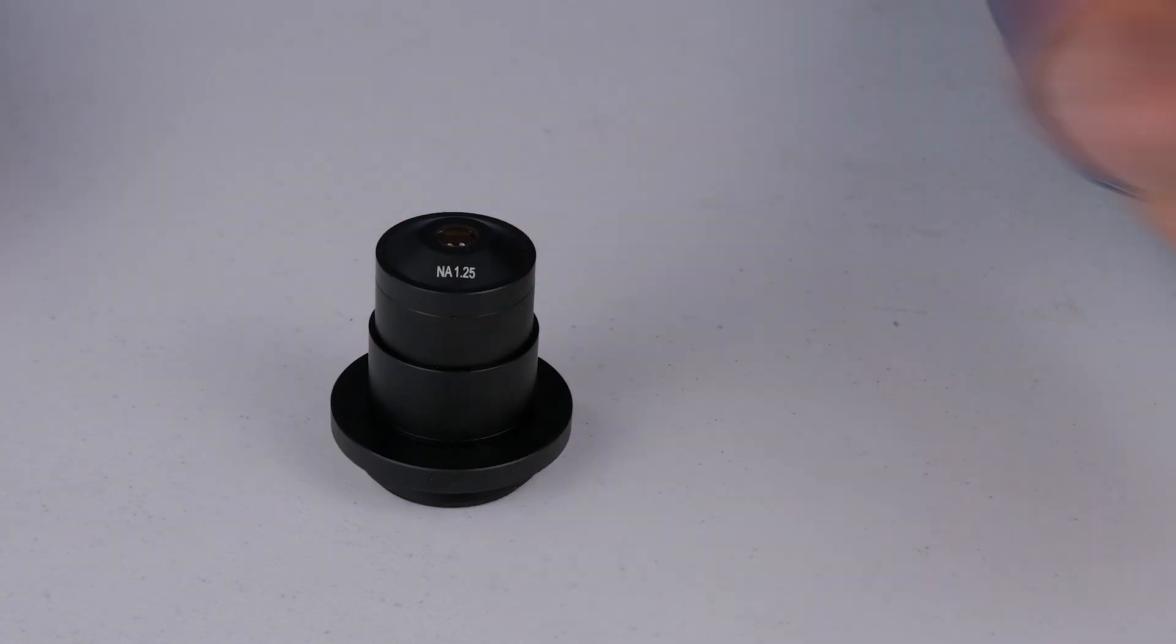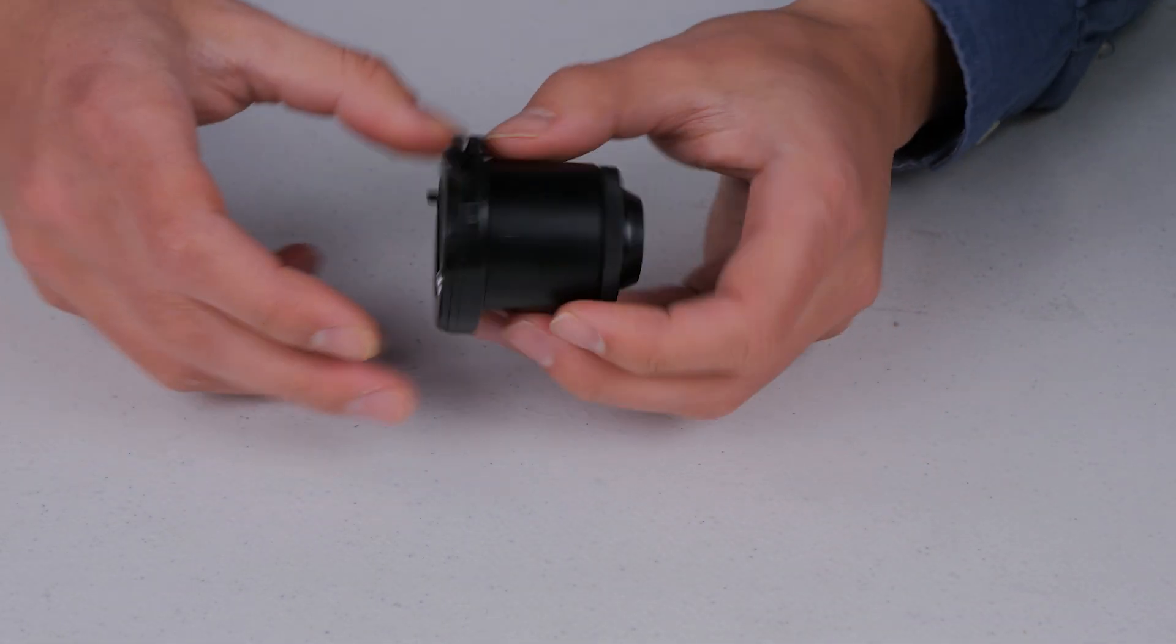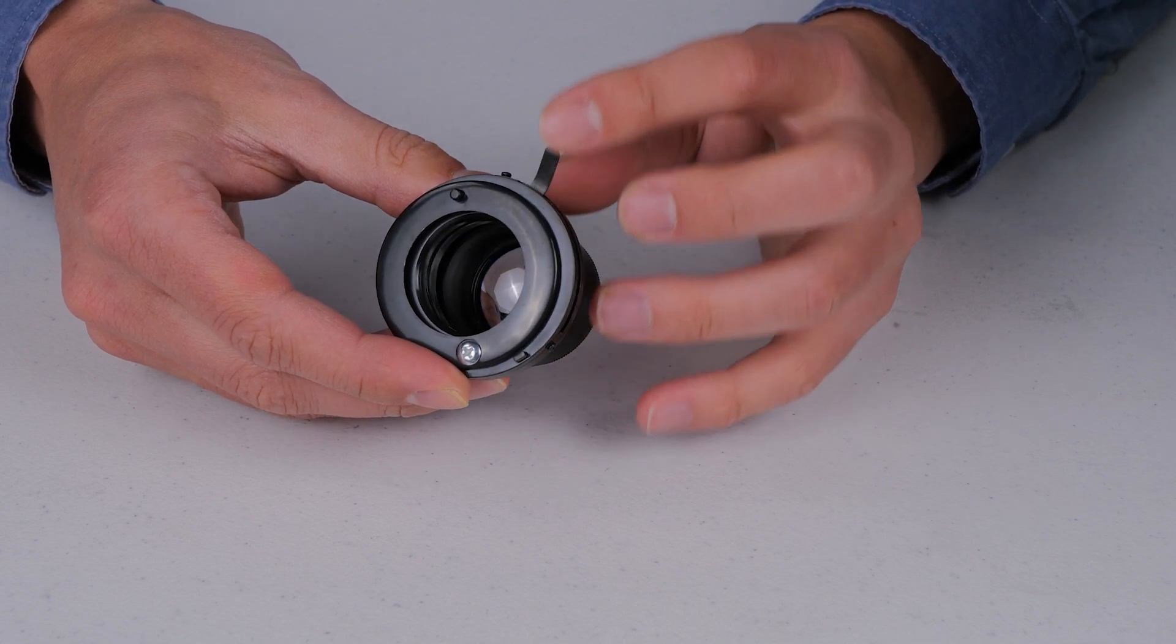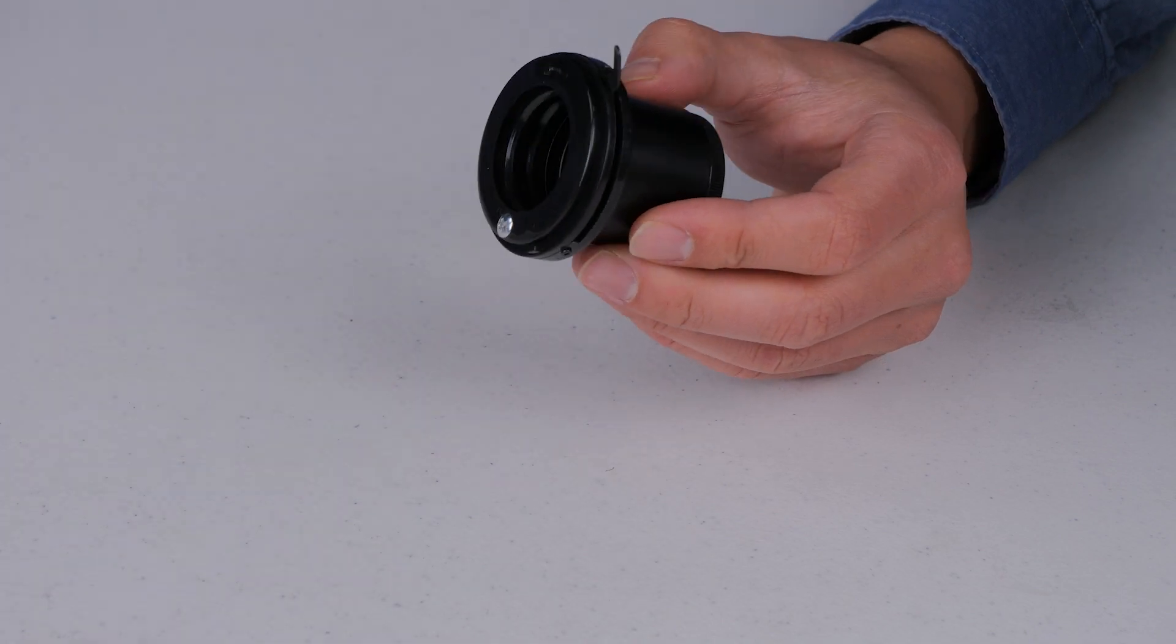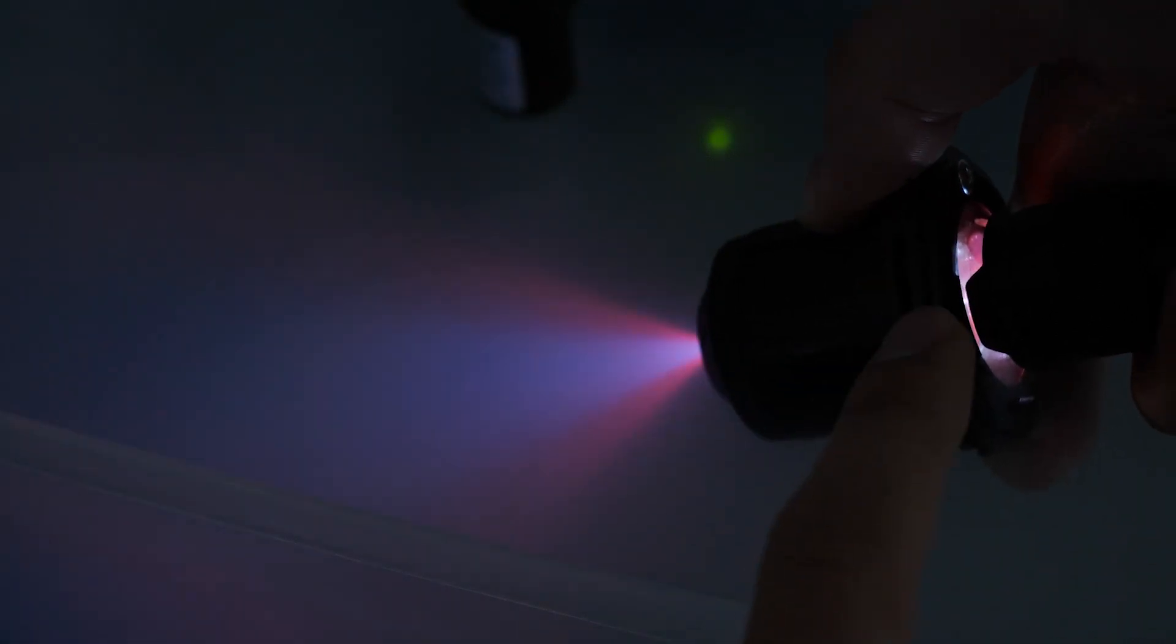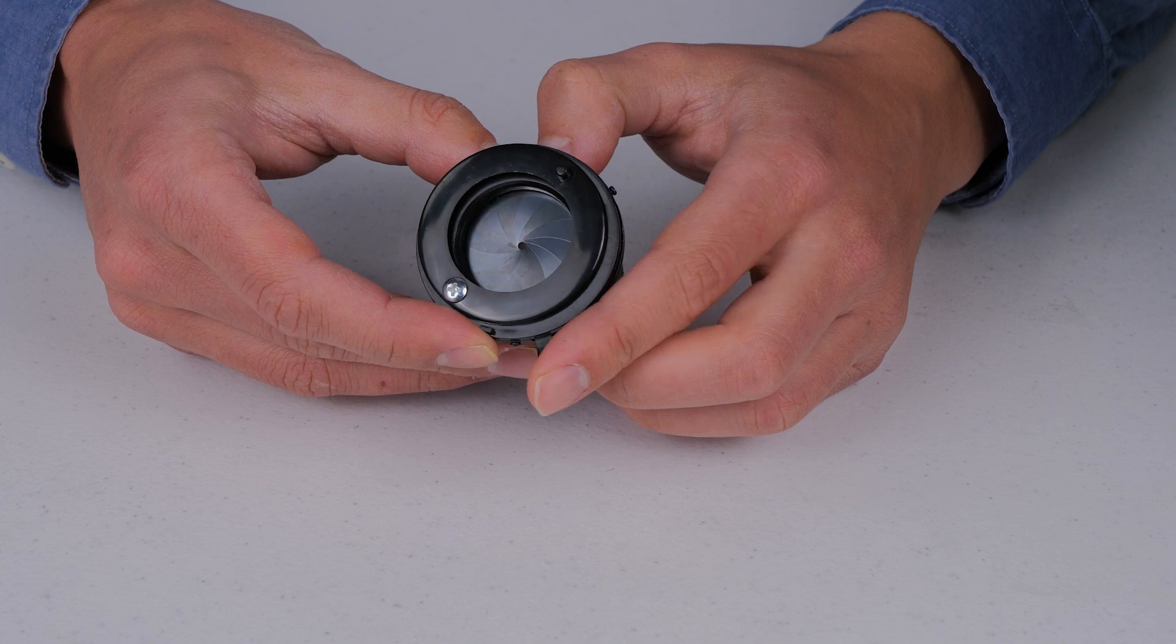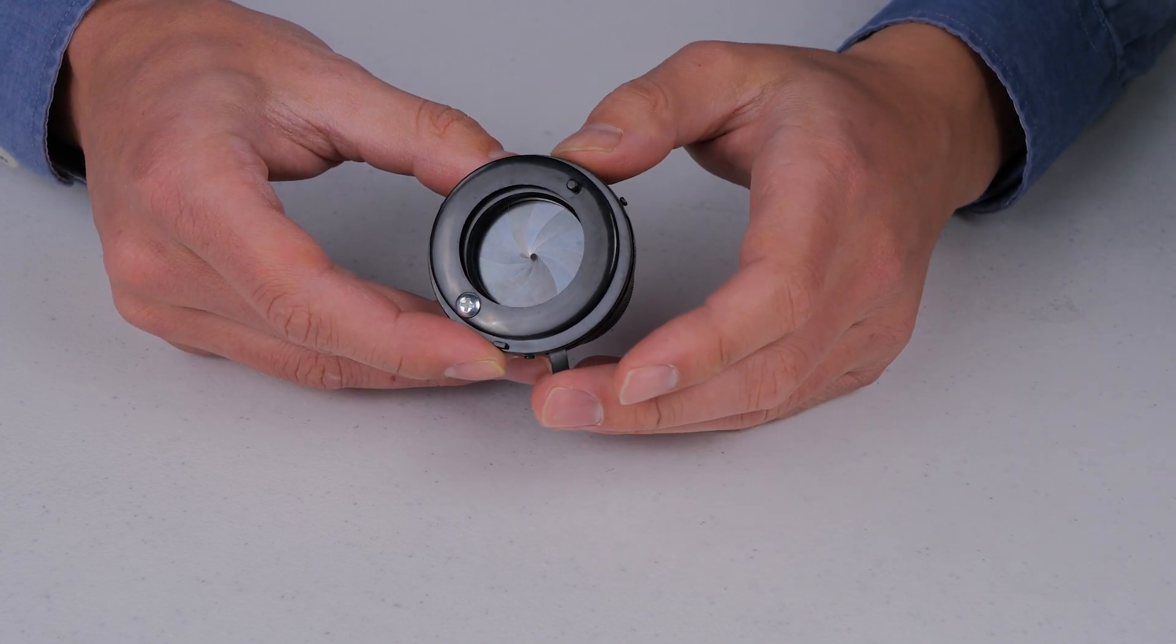But on a condenser it is going to actually be adjustable and you can change it. So I have this condenser here. You can see on the back side there is an iris that you can open up or close. So this number, this 1.25 is the largest possible numerical aperture that these condensers can get to. If you want, you can artificially limit what the numerical apertures of these are by closing down the iris. You can never exceed that 1.25 number.